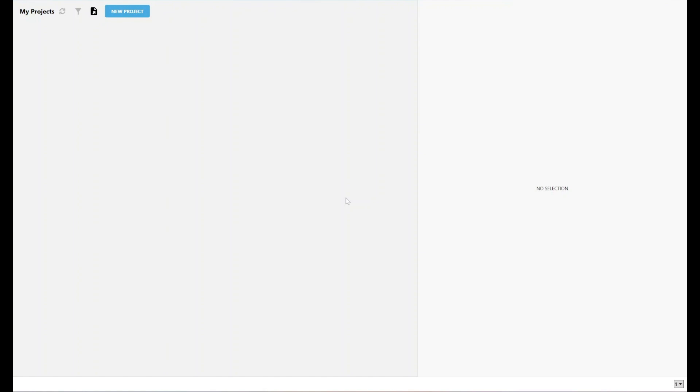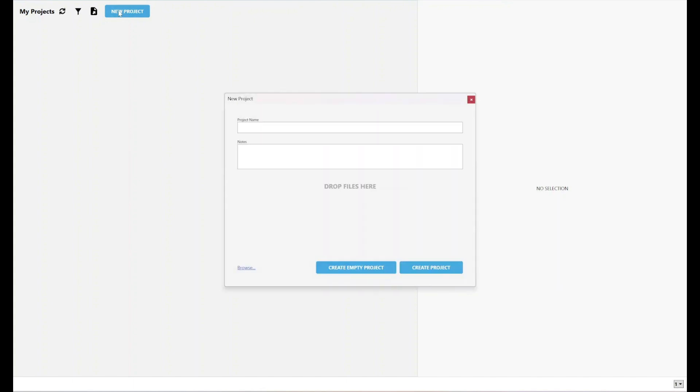As you can see, this is a completely blank folder. I've not got any previous projects within it, but if I did, they would show up here. I'm going to go ahead and click New Project, and now it's asking me for a name for my project. Lateral flow 21 CFR demo, let's go for that.